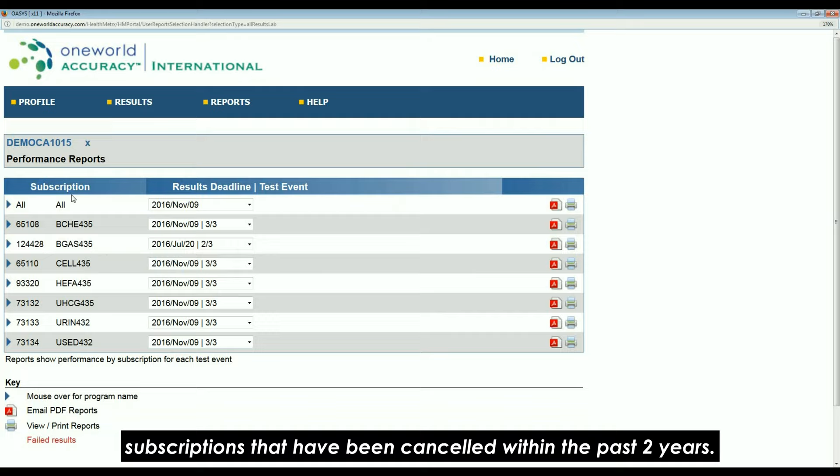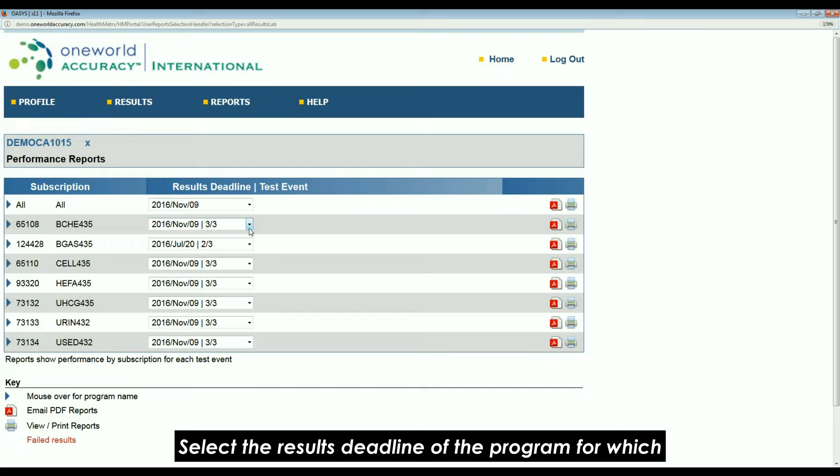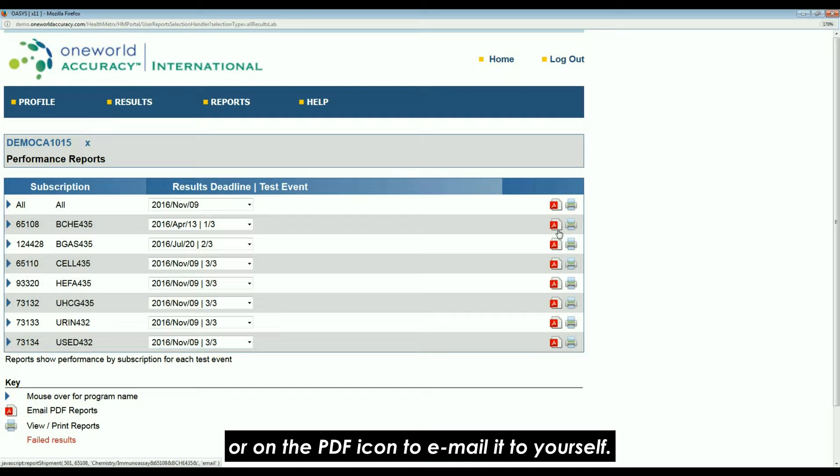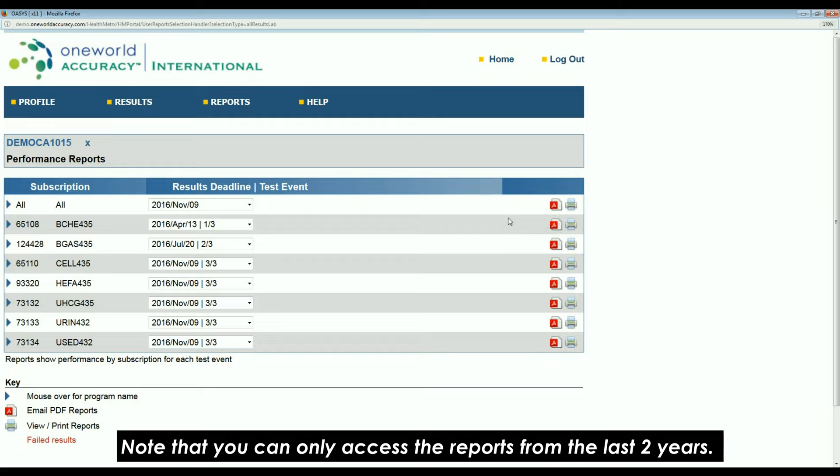You will see a list of your active subscriptions and subscriptions that have been cancelled within the past two years. Select the results deadline of the program for which you want to see the report. Click on the printer icon to view the report or on the PDF icon to email it to yourself. Note that you can only access the reports from the last two years.